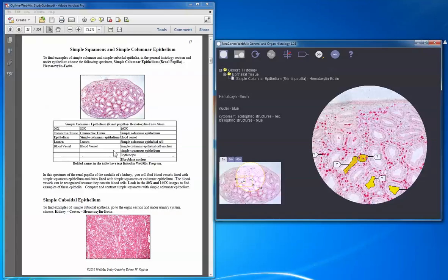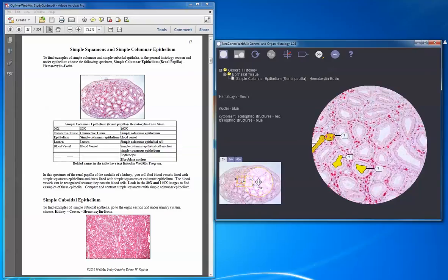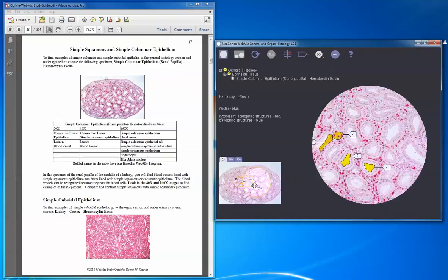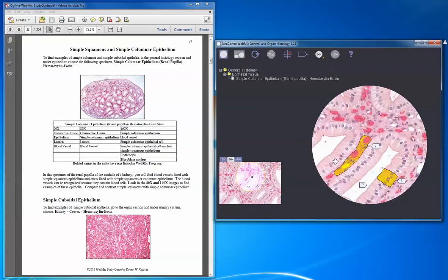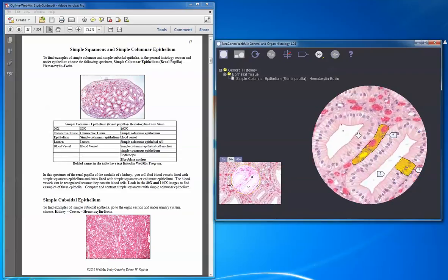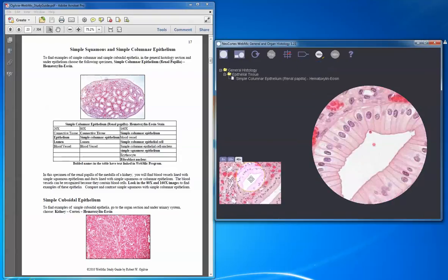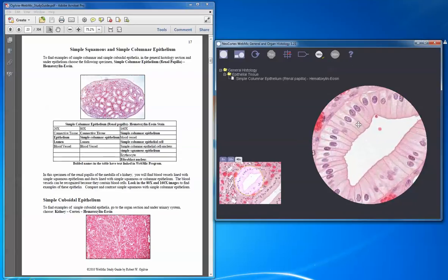Below the image is a table containing all the structures labeled for different magnifications — three columns: 20x, 80x, and 160x. The way you interpret this: 5x times 4 is 20x. So the specimen is magnified 4 times the 5x objective, giving 20x. For 80x, you take the 20x objective times 4. And the final magnification is 40x times 4, which is 160x. Things become much more clear at higher magnifications.